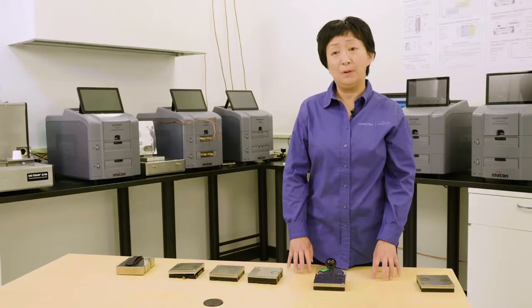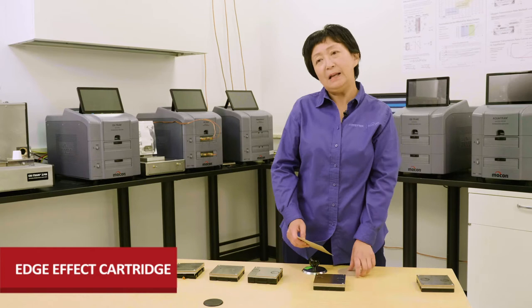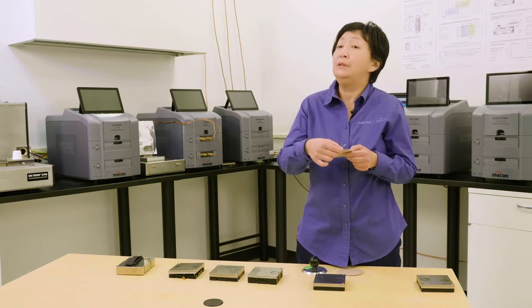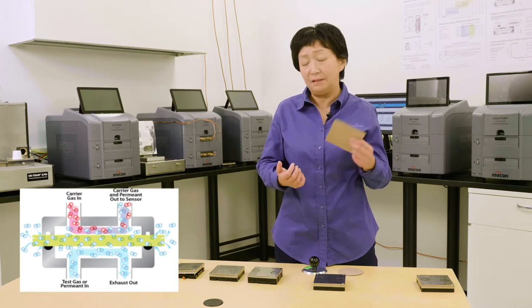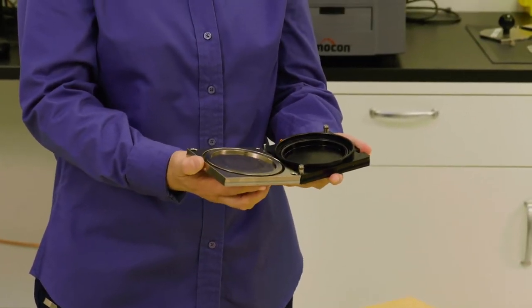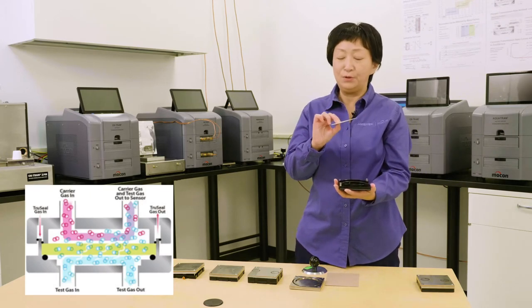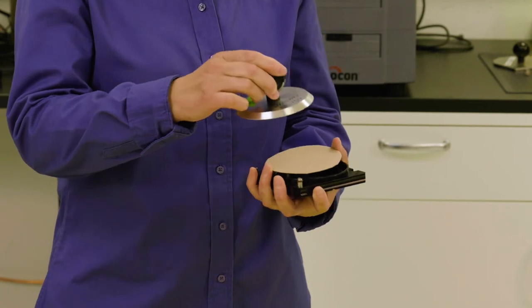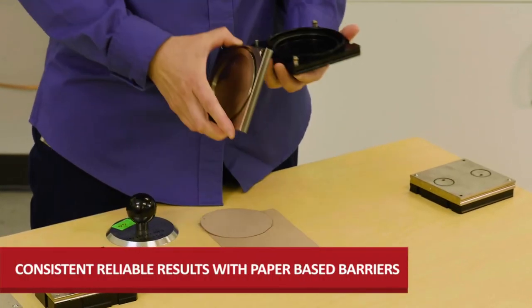The next special cartridge I want to introduce is called the Edge Effect cartridge. When doing testing for coated paperboard, because paperboard is a porous material, ambient air or moisture could permeate through the cross-section or thickness side of the sample, causing inconsistent results. We designed this cartridge with a special raised wall that blocks ambient air or moisture from getting through the edge of your sample. You use a special cutting template to trim the sample, and then you can get more consistent results.